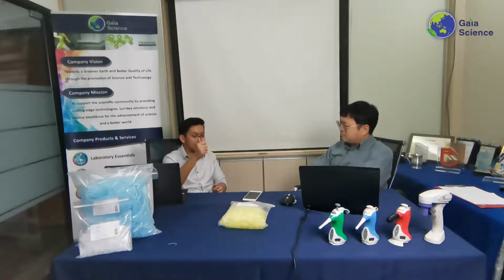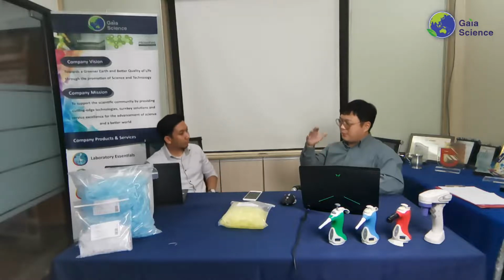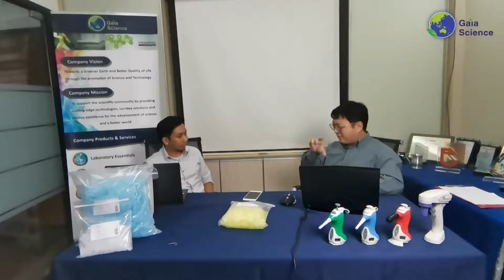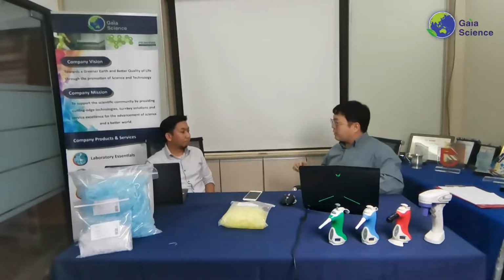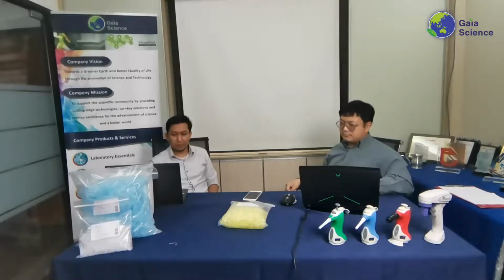When you aspirate, it is what you intend to aspirate. What you dispense is what you intend to dispense. Yep, that's true. Low retention can help solve the problem. There is a technique where you could do it with normal ones as well, where you aspirate a bit more than the fraction you need, so that you're able to mix equally and don't lose anything in between. But obviously, if you do not do the mixing technique correctly as you do the dilution, you might lose out more than by using low retention. You're right on that. Betul. I agree with you.